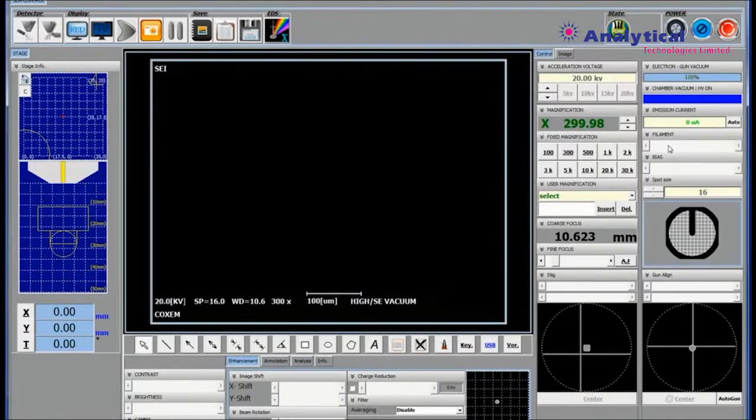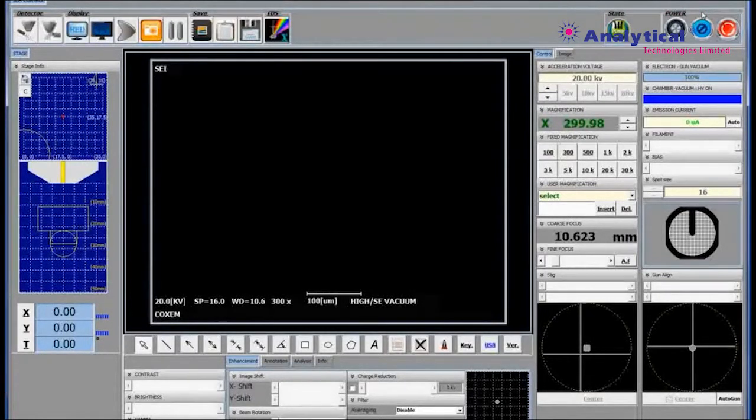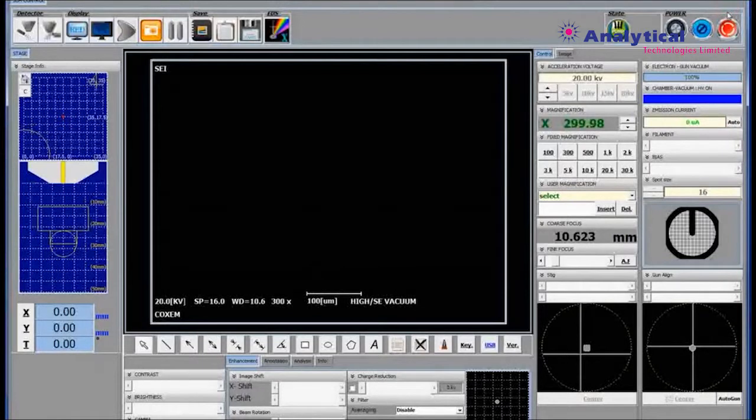Now, I will explain about the program. There is the switch button for the vent and pump state. Next to it, there is the beam on and off button, the nanostation end button, and the emergency button. The part below indicates the vacuum state. Then, when the filament is saturated, you can control the bias value to control the emission current value according to the series.